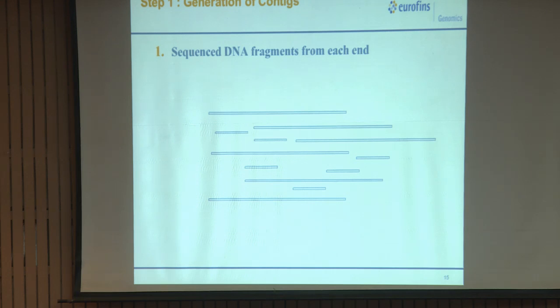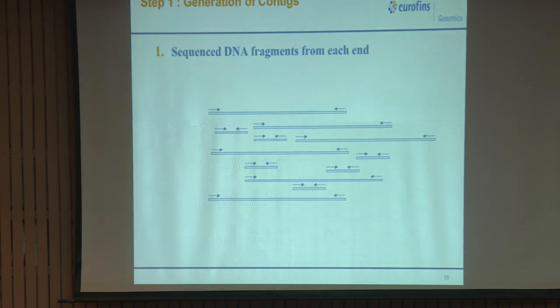SOAP de novo is one, CLC is one. These are different softwares. We also have a list, so you can see the list. This is just a presentation of how we create a contig.